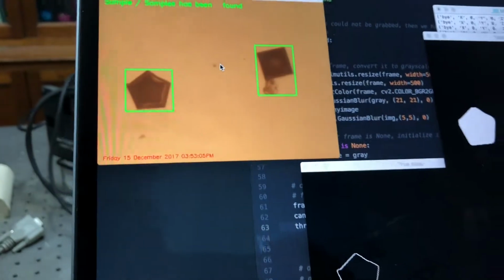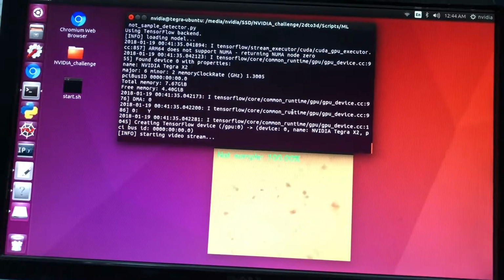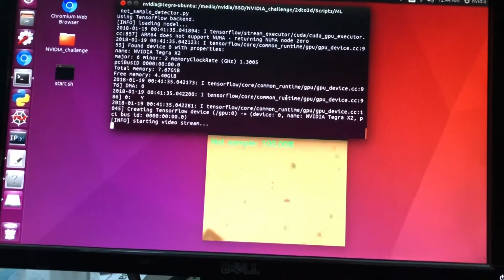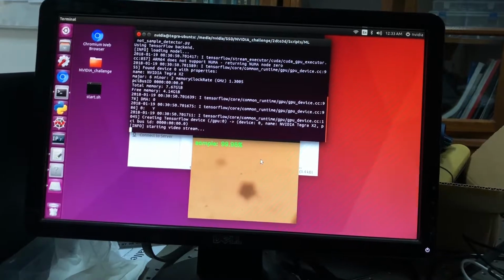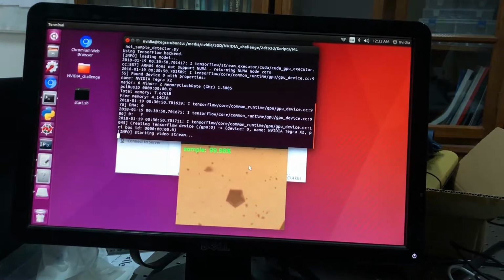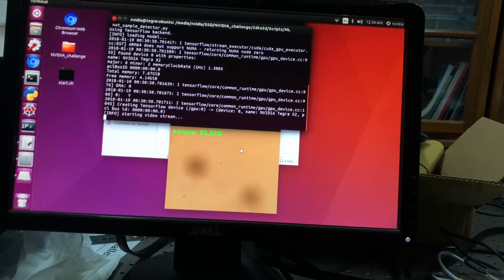Each found microstructure is compared with our trained model of our sample and gives a result of sample or not sample. In any condition, the program knows our sample, even if it's blurred. The program also gives us the result of what kind of sample it is.